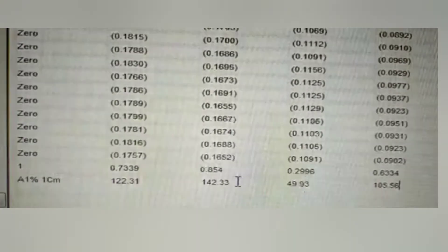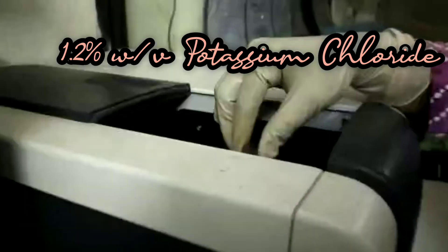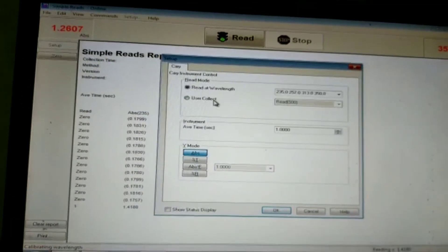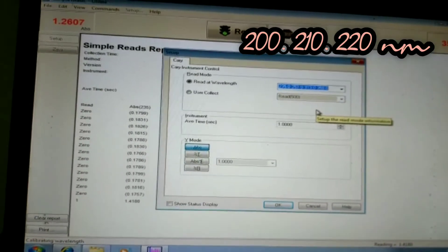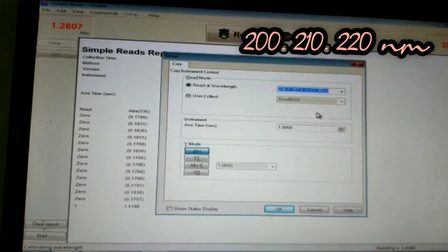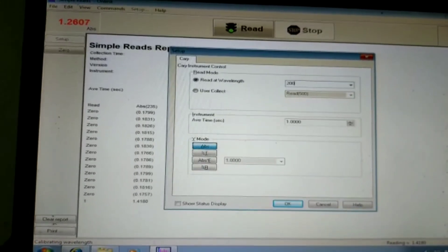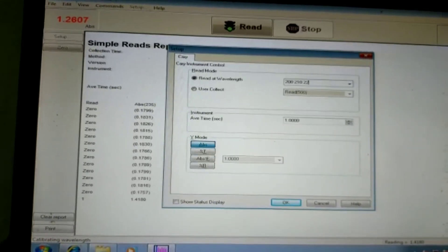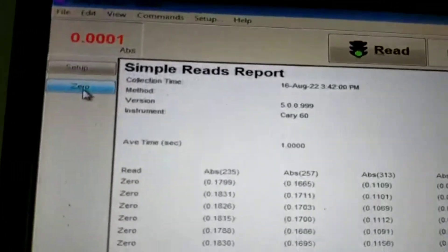Now let's check the limit of stray light. For this we use a 1.2% weight by volume solution of potassium chloride in water. First I place the blank — distilled water — and adjust the required parameters, setting the wavelengths to 200, 210, and 220 nanometers, selecting absorbance in simple reads mode. After setting these parameters I set the instrument to zero.